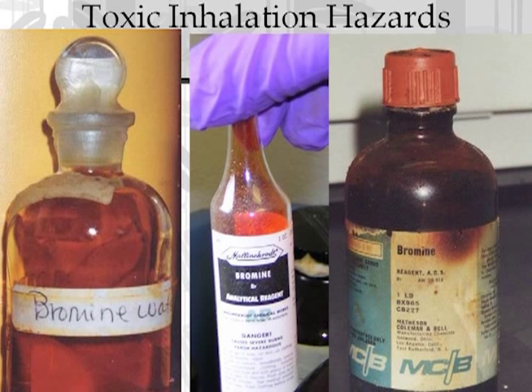Once your lung tissue is acid burned, it doesn't regenerate very well. The alveoli tend not to recover. And so this is a compound where, unless it's in solution, being used in a fume hood, the risks are very great. One of the scary parts is that it also eats through its cap, similar to nitric acid. So if you just leave it stored, that doesn't mean you're not going to get exposed to it.